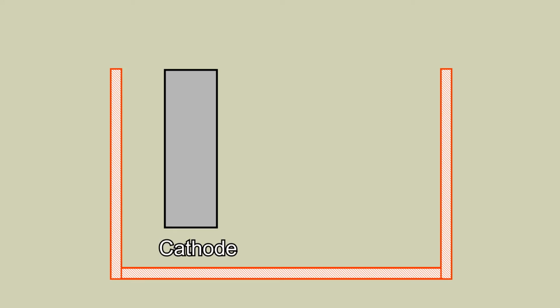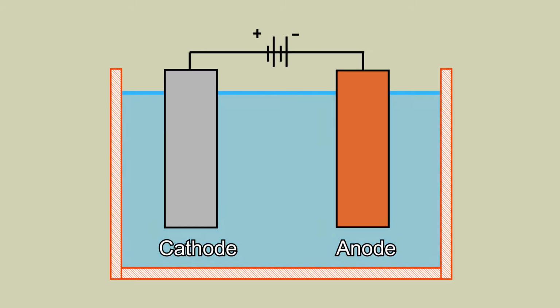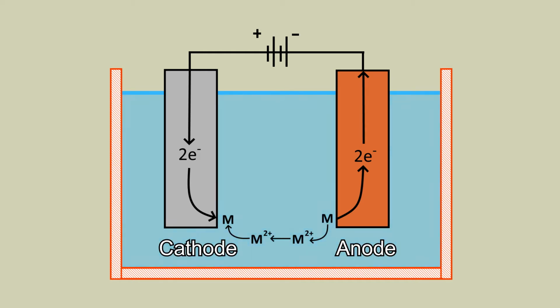Electroplating is comprised of 4 general elements: the object to be coated, acting as the cathode, the plating material, acting as the anode, the electrolytic bath in which both electrodes will be submerged, and a power source, all of which form a circuit. An electric potential is applied across the circuit, promoting oxidation at the anode, which introduces cations into the solution, where the cations are eventually reduced at the cathode, to which they deposit.